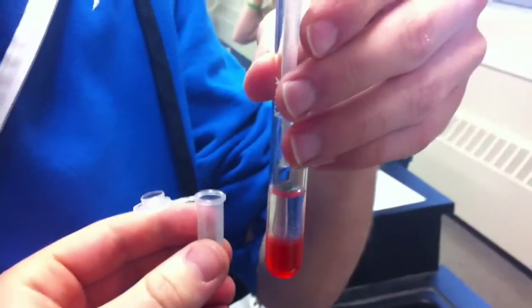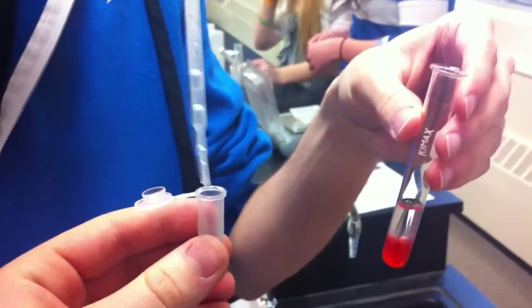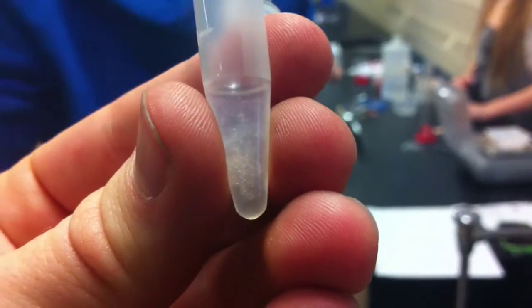Lots of DNA! The DNA was extracted from the tube and put into an Eppendorf tube so it can be set.